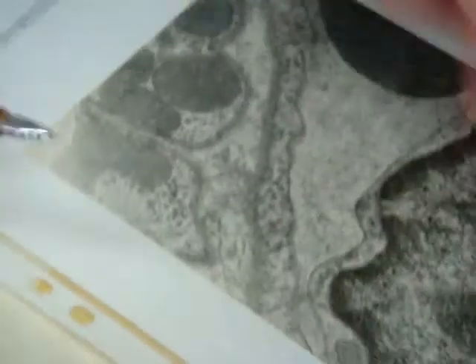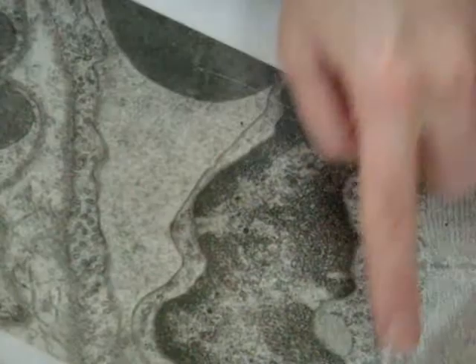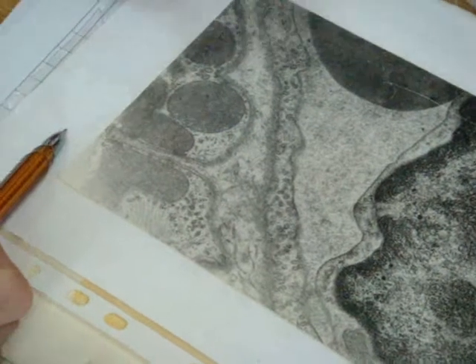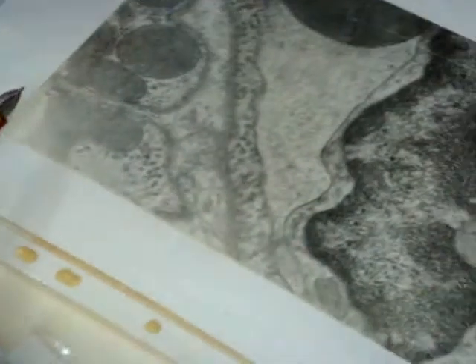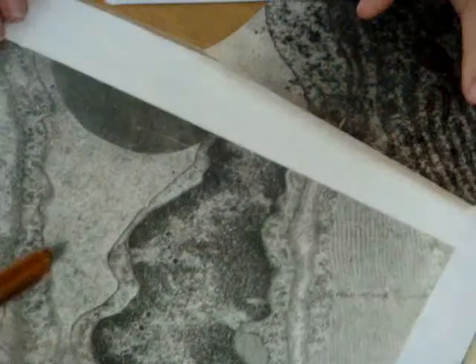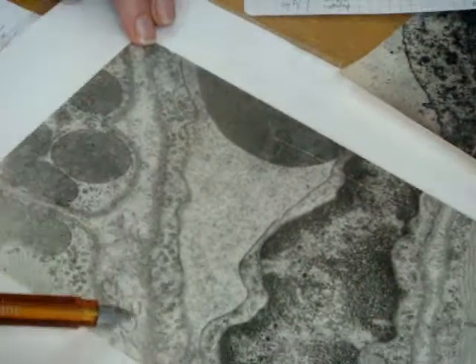This is muscle tissue, striated muscle. We can see the arrangement. Here we can see T-tubules, and if they are opposite the Z lines, this will be cardiac. But we can't determine, no details, no information. Here, a blood vessel, in the lumen we can see an erythrocyte, this is the nucleus of an endothelial cell, this is pinocytotic vesicle transport process, and collagen fibers.